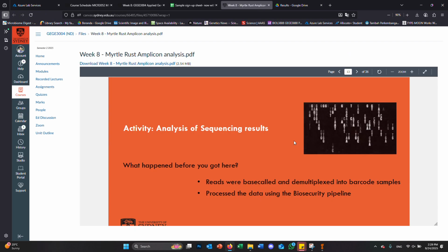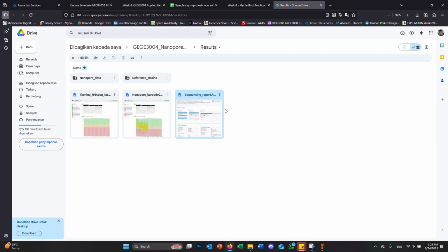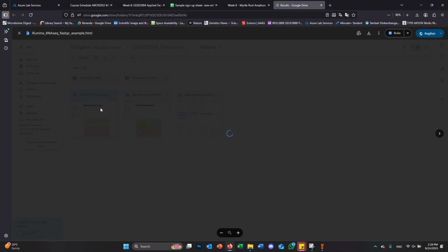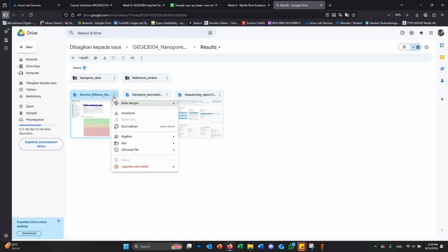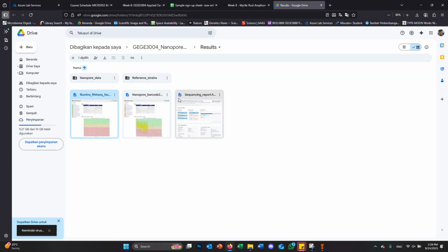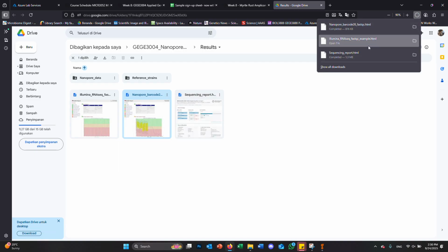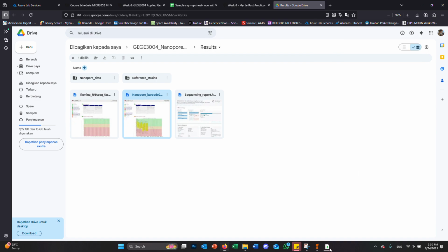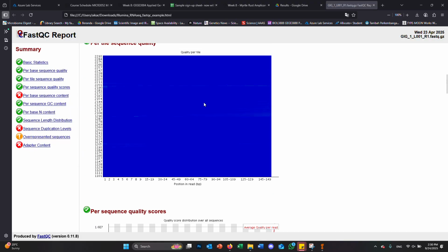Okay. So is this because our Illumina has some kind of different coding in the file, because of the tile? It's probably the way that the Illumina chip is sequenced. Yep. So there are other differences, nicely spotted. Our Illumina data is sequenced on a chip, like a flow cell. They get attached to a chip, and maybe that triggers another quality measure that's called per tile quality. But the Nanopore does not have that measure.